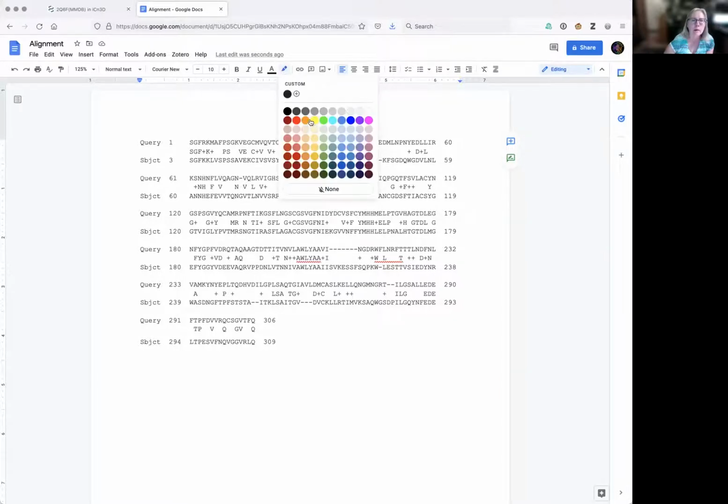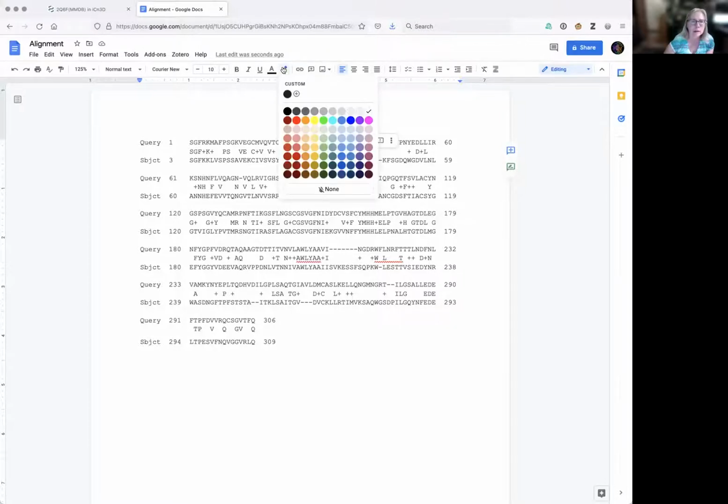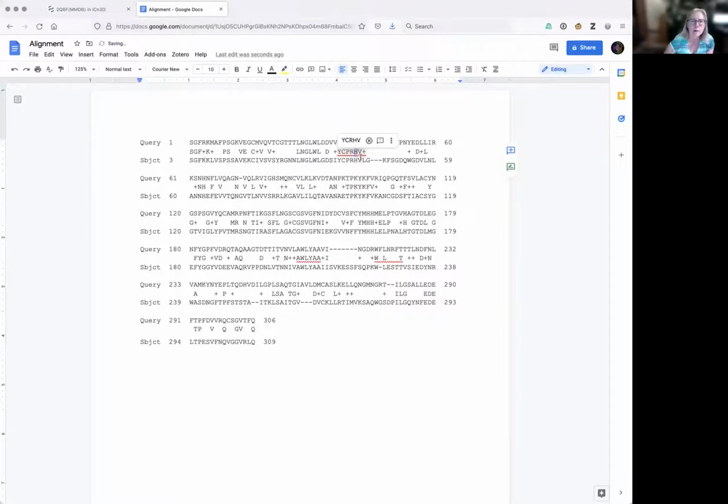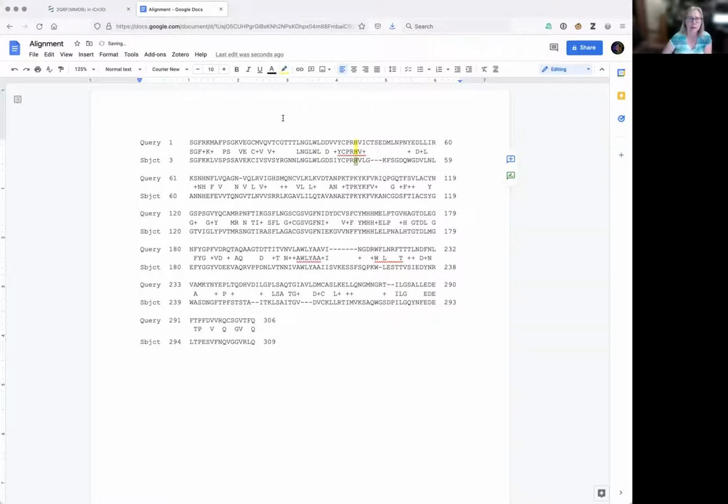There we go. And it's great that histidine is present in both my query and the subject sequence. Now let's just stop for a minute and think about what these are. My query sequence came from SARS-CoV-2, and it was from the protein 7VH8, and I think chain A.